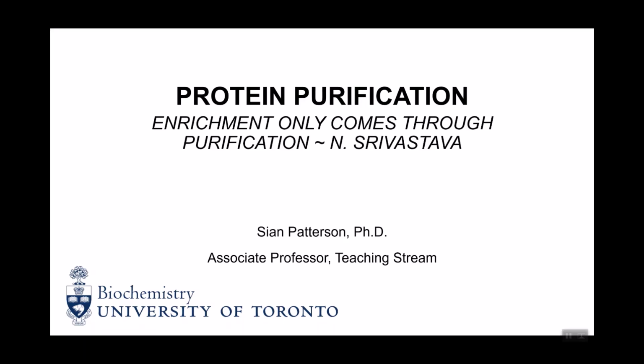Enrichment only comes through purification. This is a yoga quote, but it's also applicable to proteins, in particular enzymes. As you purify an enzyme, you enrich your sample with your protein of interest, and in order to study and characterize a protein, we really do need a pure source for your experiments.